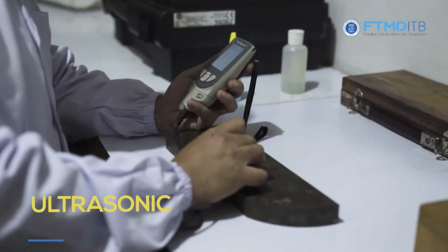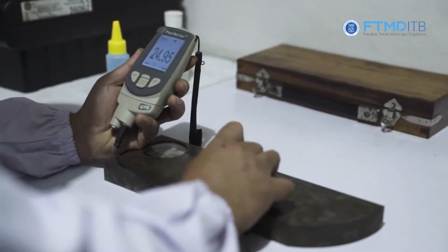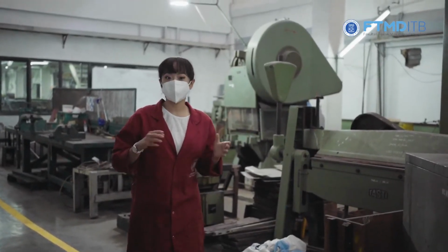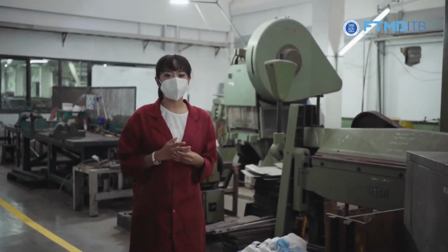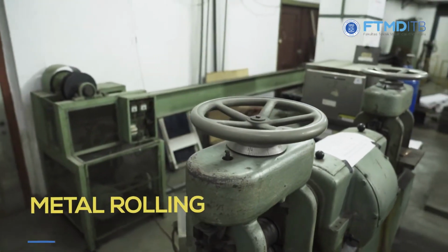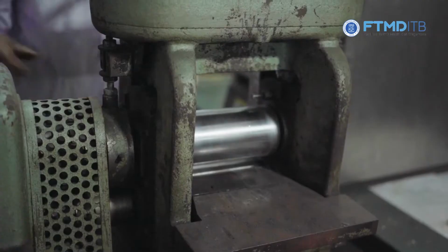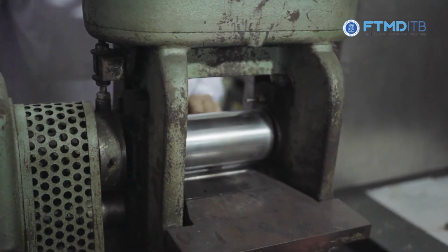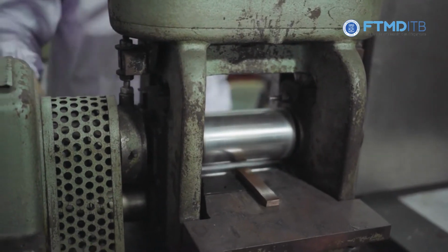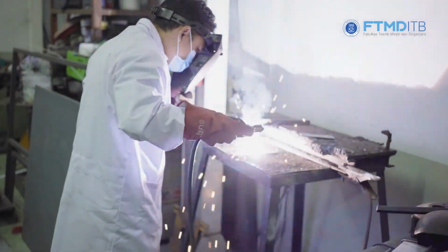In this lab, students can learn about non-destructive tests, especially ultrasonic tests using this tool. In our lab, students can learn some material processing such as metal rolling, welding, heat treatment of metals, and surface treatment of metals. This is the metal rolling machine used to reduce the thickness of the material either by cold rolling or hot rolling process. The effect of the rolling process can be seen by the microstructure changes inside the materials. Students can learn the welding process using the shielded metal arc welding method.